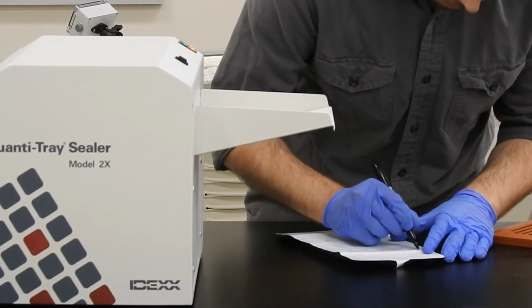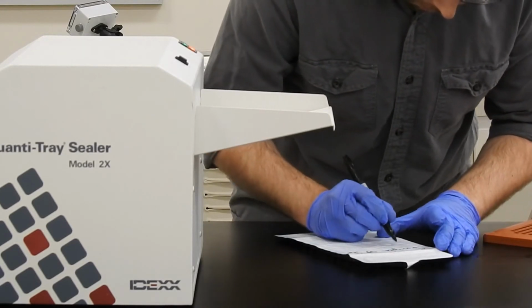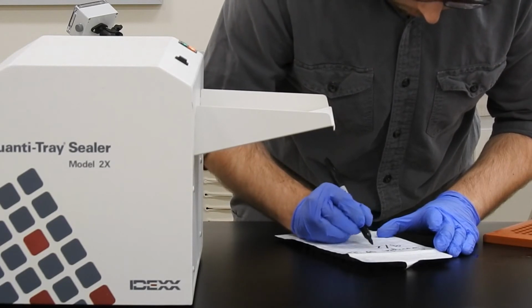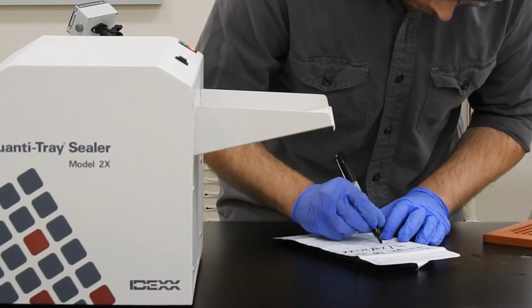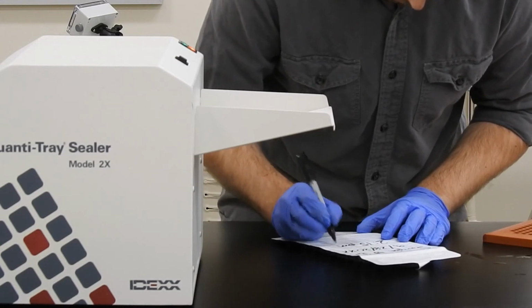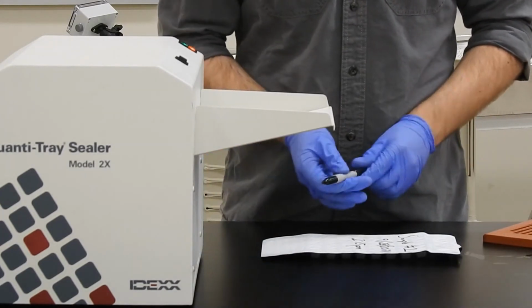So now that you've done all the mixing, all the pipetting, and distributed everything, the only thing left to do is make sure that you properly label this so that later we know what sample it was, what date it's from, and what time it was put into the incubator, which is important because we want it to incubate for 24 hours. So clearly label and well-written handwriting. There you go. And then once that's done, all you need to do is add it into the incubator.